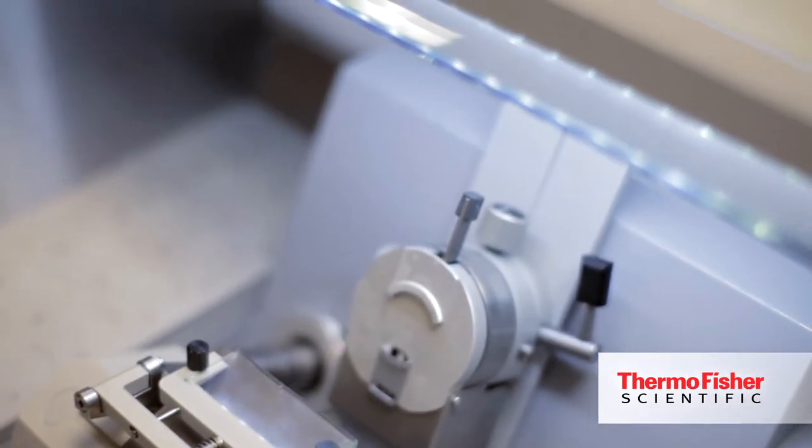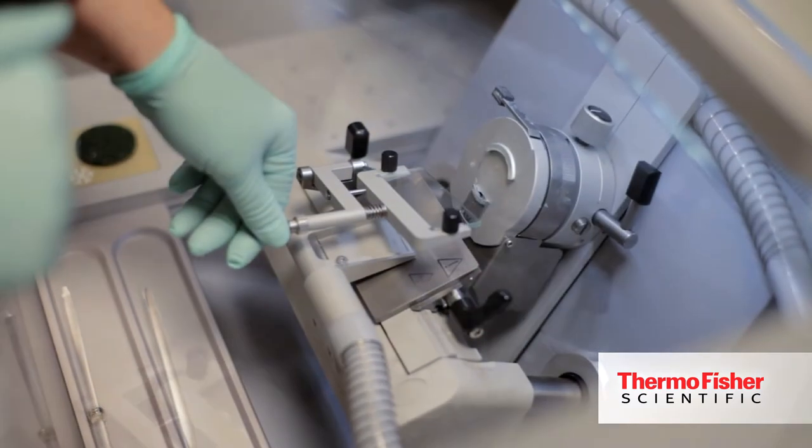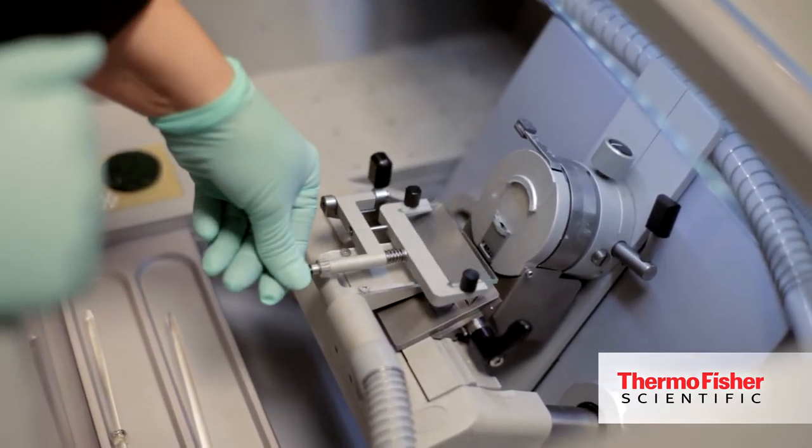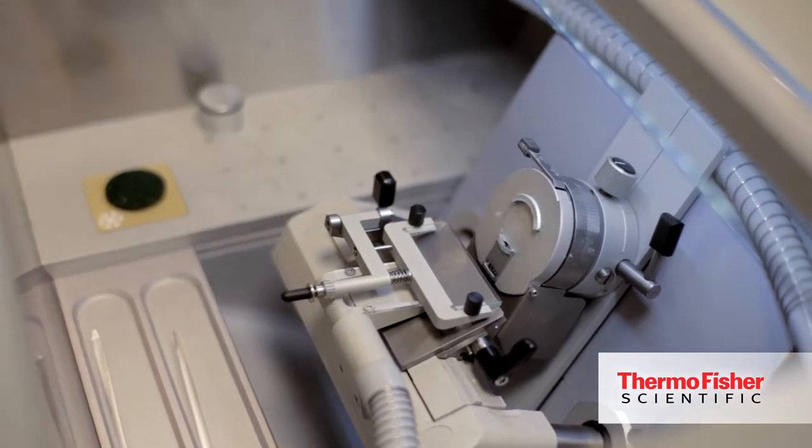By using this rapid temperature control system you're more accurately able to control the temperature by directly contacting the specimen. We are able to adjust temperature on the specimen holder, the blade holder, and also the cryobar. This allows for more consistent sectioning and higher end results.